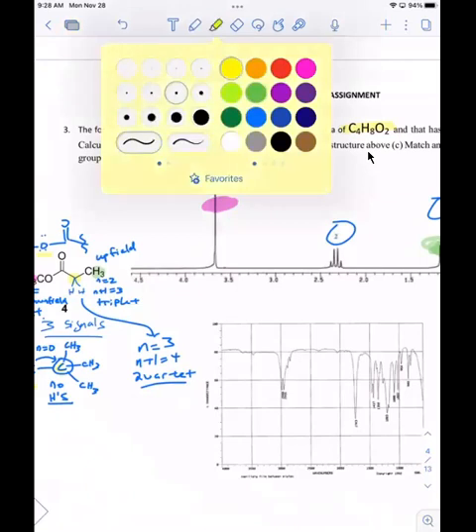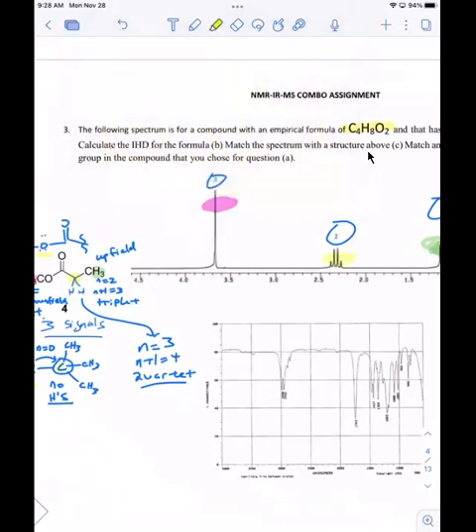That's a good question. I said at the outset that you can do different nuclei. You can do oxygen, fluorine, phosphorus, silicon NMR, deuterium NMR. It just depends on what type of nuclei you want to study. Right now, we're just studying the proton nucleus, so the hydrogen nucleus. That's why only hydrogens show up in the spectrum.